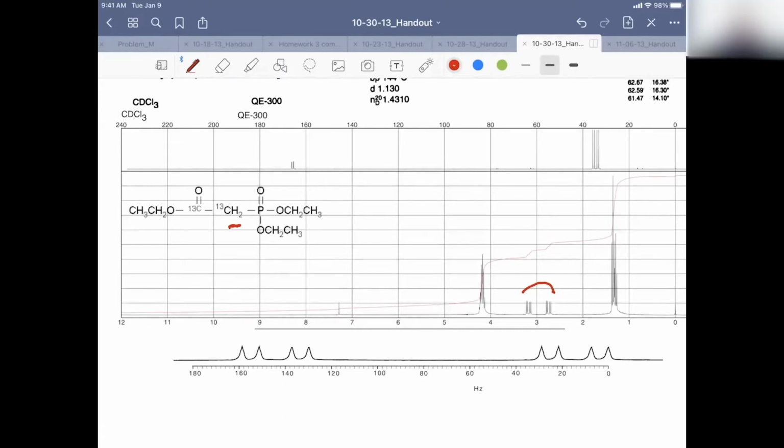Doublets of doublets of doublets. A doublet. So this is, run that by me again. So I think it's 4 Ds or 3. I think it's 3 Ds. Doublet of doublet of doublet.